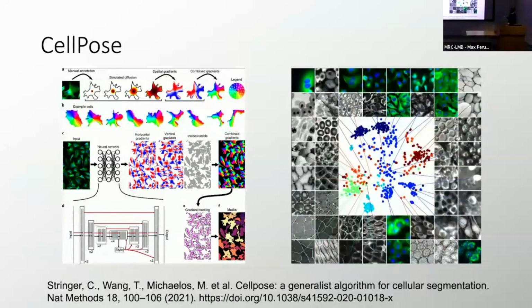It's been trained on many images of different types. And there is also the style part, which allows it to detect, during the prediction, the style of the image, and then directly use the right combination of weights to process the image.